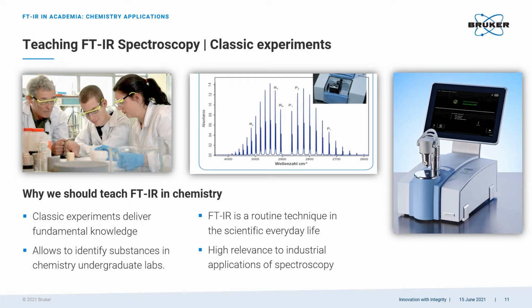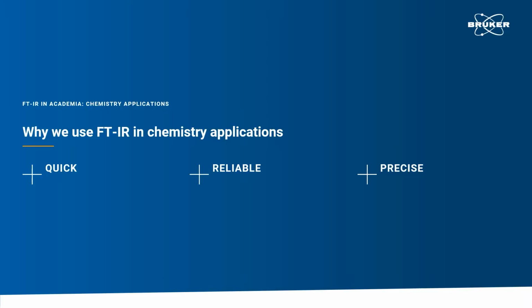And I think it is important to let students know that FTIR spectrometers no longer are these huge instruments with clumsy software. For years, software has catered to that industrial need, also benefiting researchers with a more simple means to conduct their analyses. But let's summarize what makes FTIR so valuable in chemistry applications, and after that, Shah will jump right into the applications. Above all, it is a rapid method.